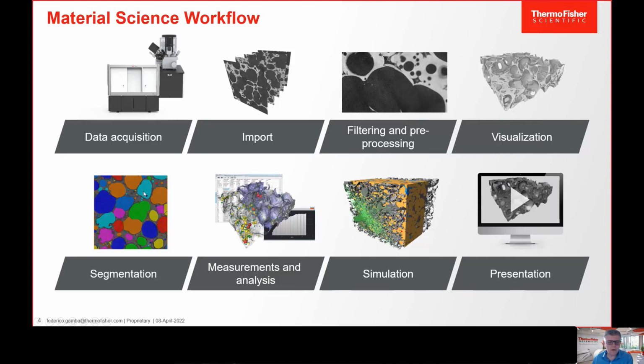So what people do, they segment the data, so they try to assign pixels to objects, to meaningful parts of the object. If you are in rock, most of the time you want to assign, I don't know, pores, grains, or different minerals. If you are in a completely different material, it could be different, but you get the point, I think.